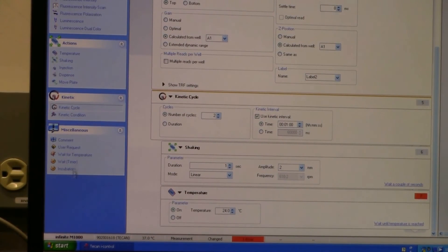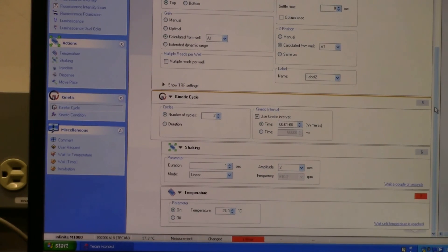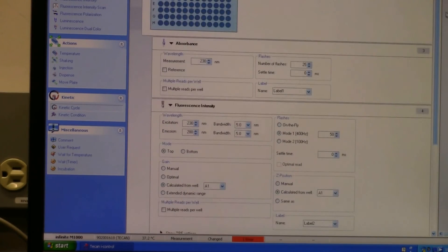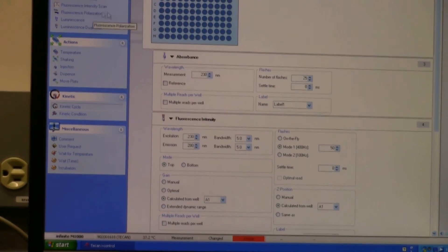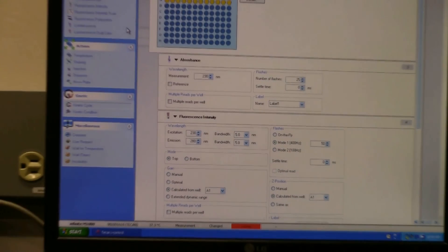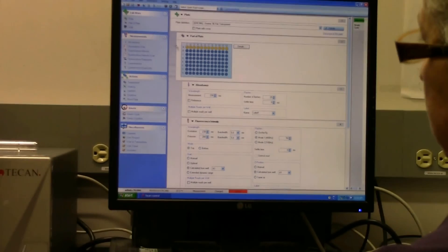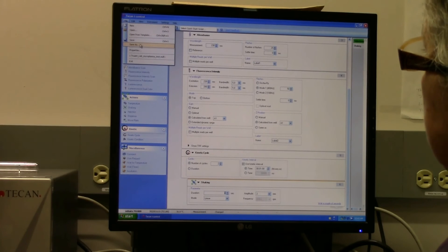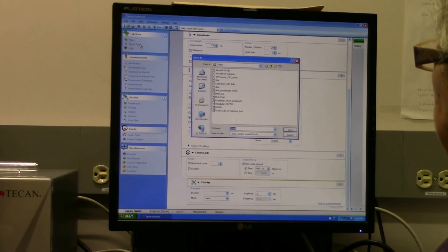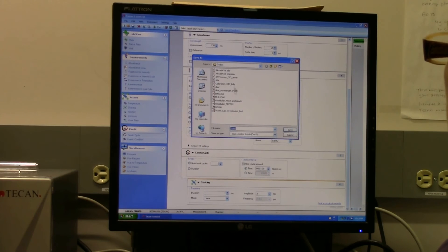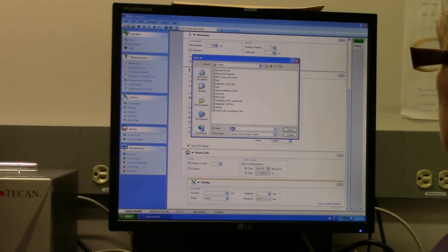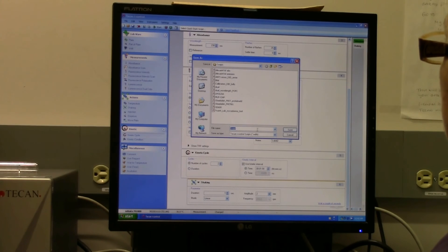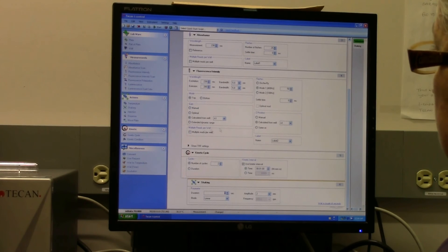And then there's some other stuff here which is not usually used. So that's basically it. Once you've got that set up, you can actually, if you're going to come back and do this multiple times, you can actually save this file. So if you want to save it, you go to File, Save As, and it saves it as this Tecan iControl script file, and it's got its own folder where it saves it. So just give it a name that's relevant to you and then save it.